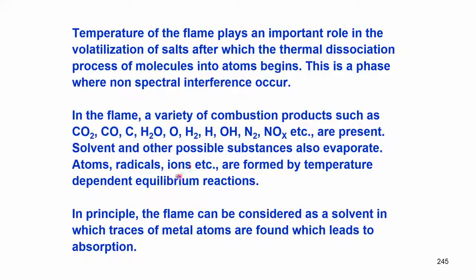You want to determine gold, but along with the sample you will have so much sodium chloride, magnesium chloride and several other elements in the sea water. So, all those things also will evaporate. So, atoms, radicals, ions, etc. are all formed by temperature dependent equilibrium reactions.